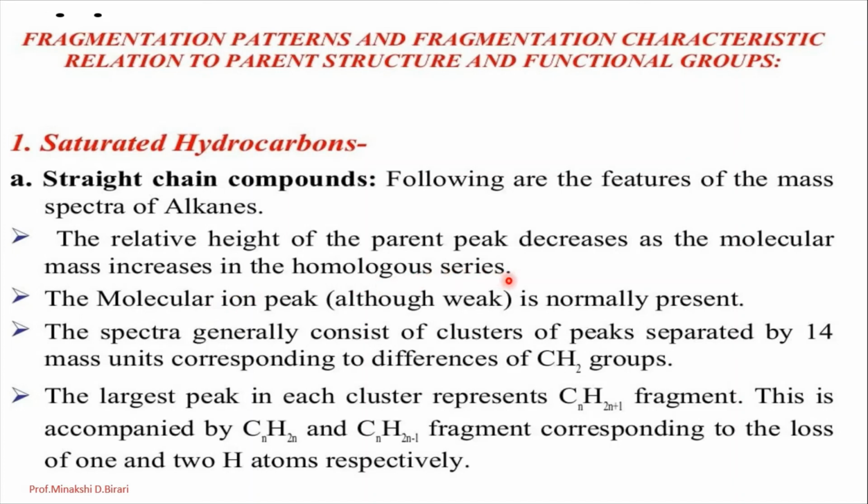Second, the molecular ion peak is normally present, although it is weak. Then the spectra generally consist of clusters of peaks separated by 14 mass units, corresponding to differences of CH2 groups. The largest peak in each cluster represents the CnH2n+1 fragment. This is accompanied by CnH2n and CnH2n-1 fragments, corresponding to the loss of 1 and 2 hydrogen atoms respectively.